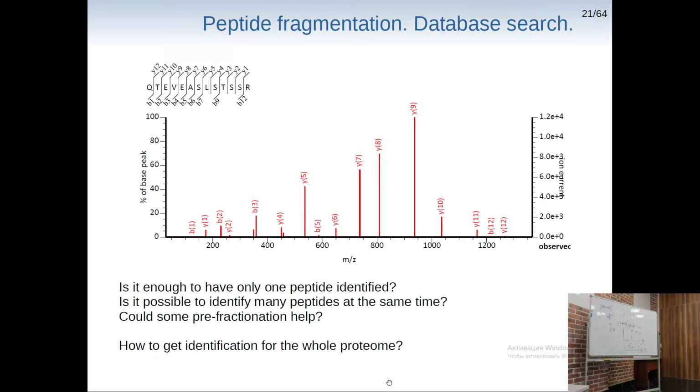And if you know that you have only one protein in a gel, for instance, and if this is a signature peptide, or let's say a unique peptide, we should have at least two, right? But if we know that we are working with this animal and in this position in the 2D gel should be this protein, and we get an annotation of just one peptide, we can say that, well, probably, yeah, we can at least annotate it, right?